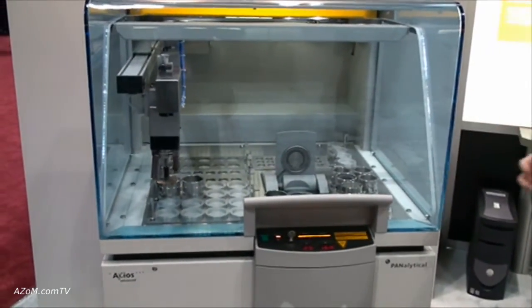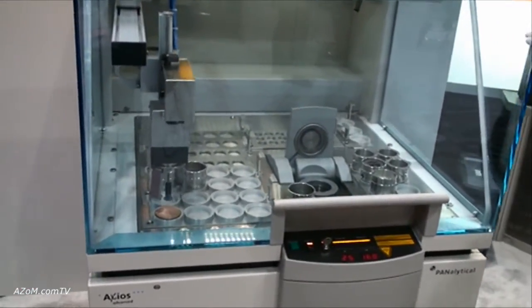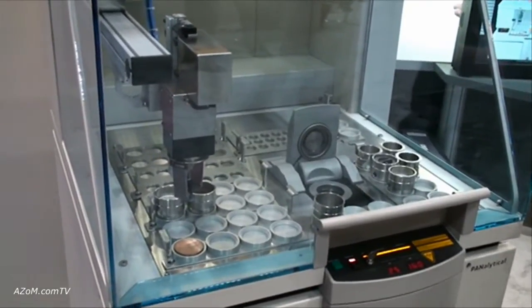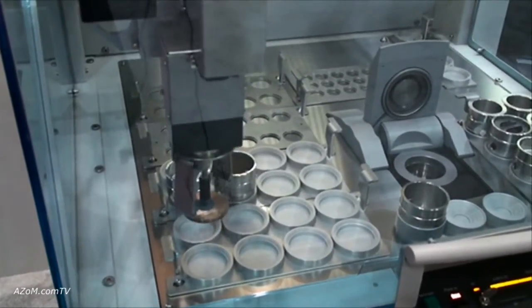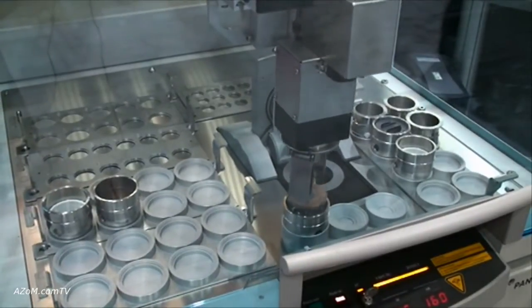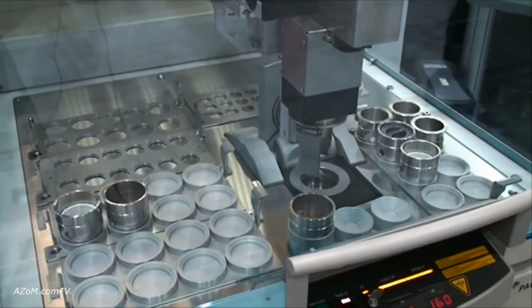The system is a fully capable wavelength dispersive XRF for chemical analysis from beryllium to uranium, and as you can see it's equipped with an automatic sample changer that can handle a variety of different sample materials, as well as a whole number of analyzing crystals to allow it to analyze from beryllium to uranium.